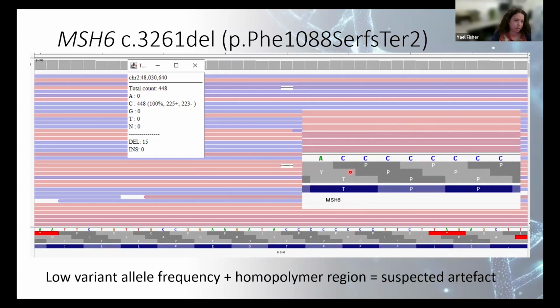The sequencers might miss one of them, and this would be a common variant. And if it is indeed a common variant, you're going to see it in many of your cases and not just in one. So if you start looking at these results and you see one of these variants that come up frequently, it's probably a sequencing artifact.